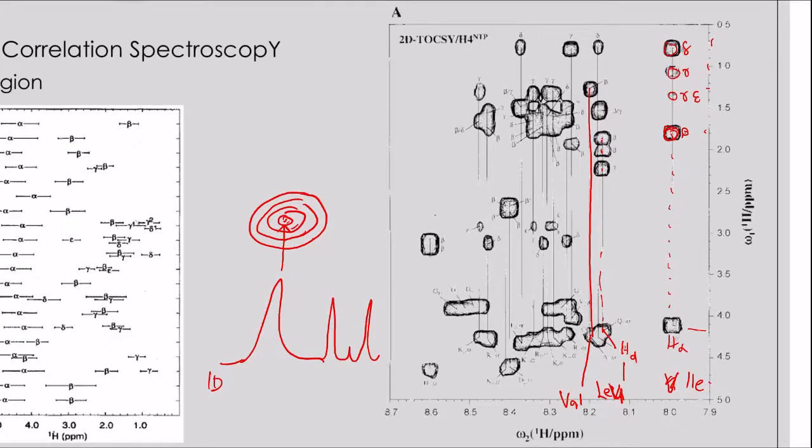This one is histidine, for example, and then glycine, because it has no chain or aliphatic chain on the R group, is just a single broad peak. So that one is glycine.